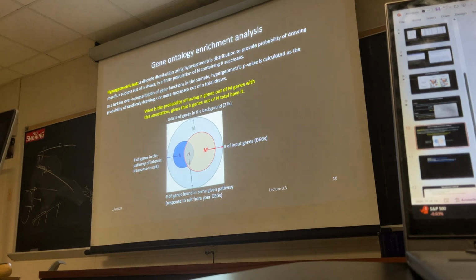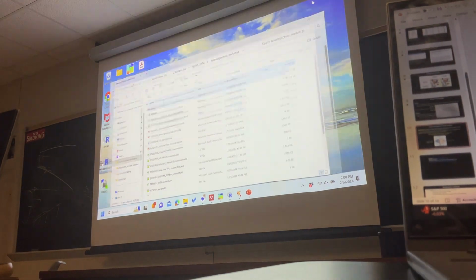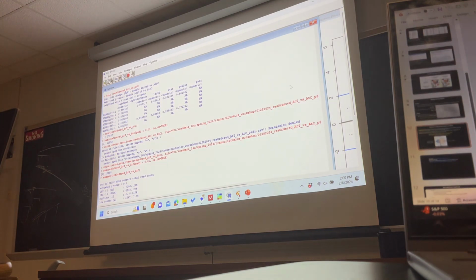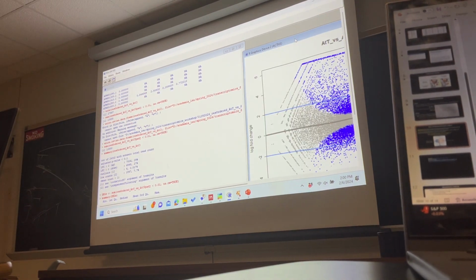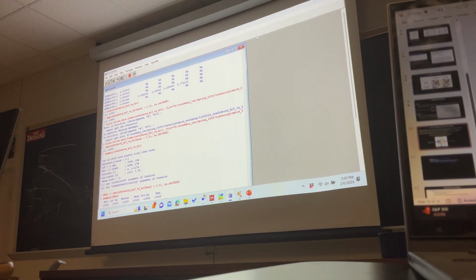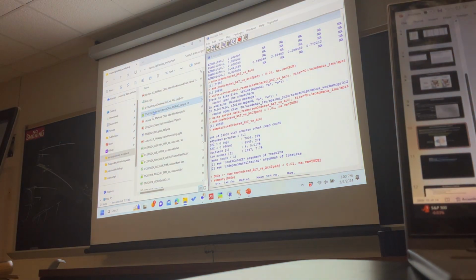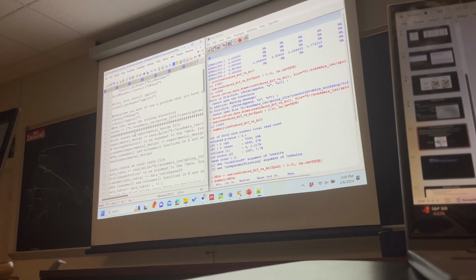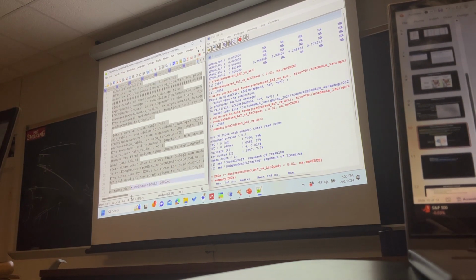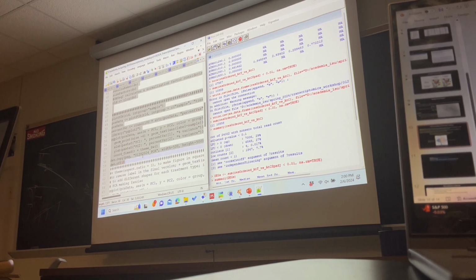But before we go here, maybe if you haven't had time to run DESeq2, I'll just show one more time, and then we can move on from there. Okay, so I'll just go through the lines that we did last time. So we made the PCA.